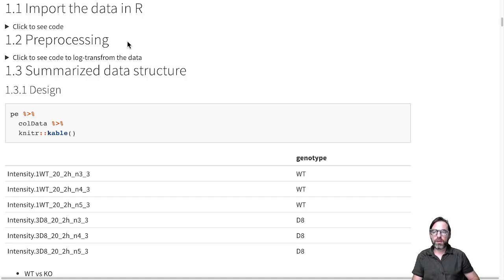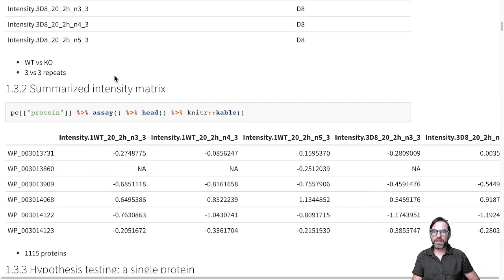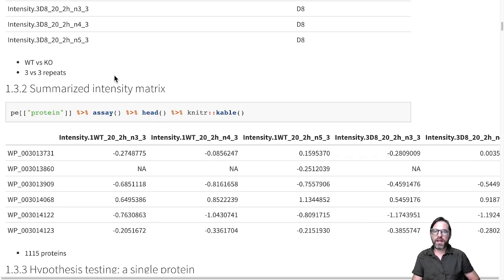We will now explore the summarized data and I will first look at the assay data, at the data of the protein expression values that we have obtained after summarization.